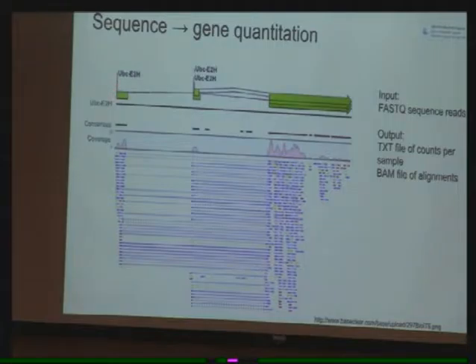And you just say, okay, in this region, let's say this is one gene. In this region, there are this many reads, and we count them up, and that's how many there are. And in this region, there are that many reads. And in this region, there are that many reads. So that's the really simplistic way that you can get from sequences to quantitation. When I say simplistic, that is the most simplistic algorithm you can use. There are much more complicated ones for inferring the quantitation of transcripts that I won't go into completely now. But that's the basic idea.